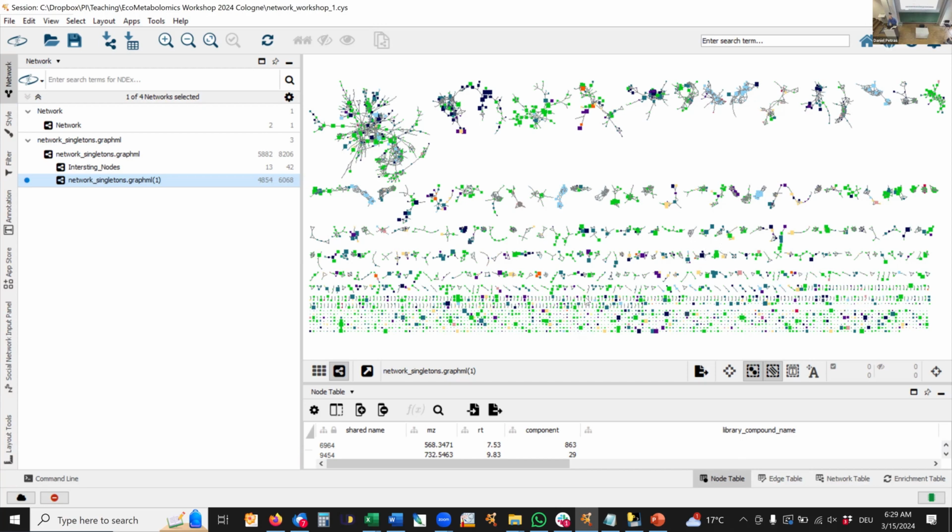All right, so now you have a cleaned up network, and when you browse in there, you should hopefully find fewer artifacts that are actually coming from your blanks. But okay, so now we want to figure out what matters within that data, right? A very straightforward way to do that is to load in the mean decreased accuracies from our random forest classification as an additional attribute.